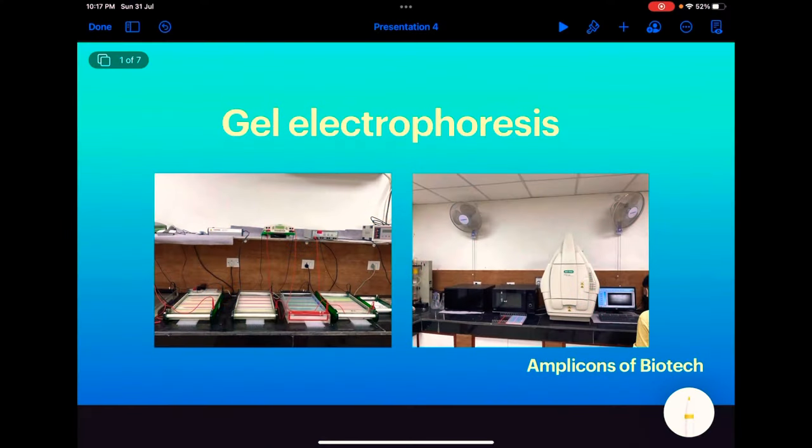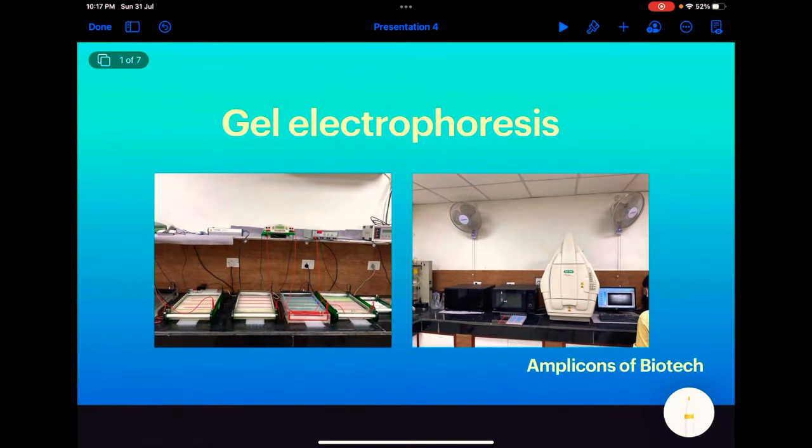If you are still watching the video, you might be familiar with these pictures: gel electrophoresis unit and gel documentation system. Using these two instruments or electrophoresis technique, we can check our PCR results and other nucleic acids like DNA and RNA.